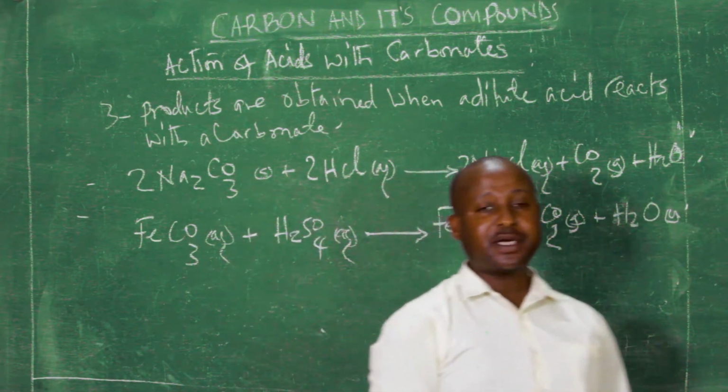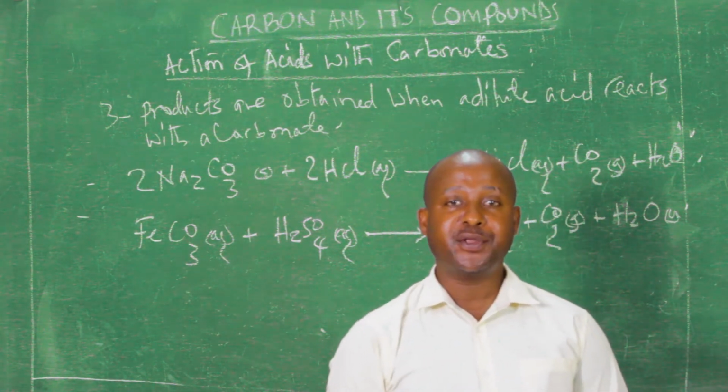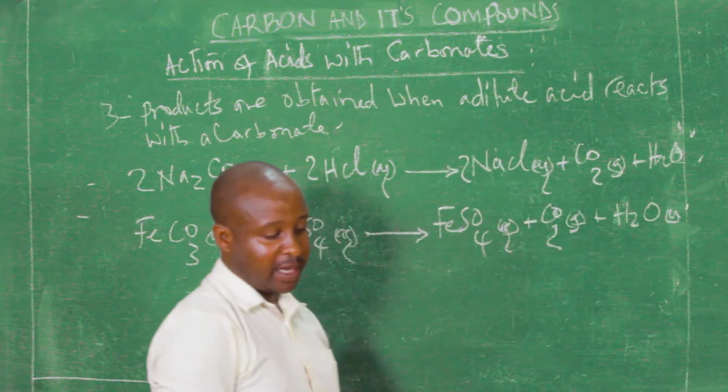How about when calcium carbonate reacts with dilute nitric acid? Let's have a look at this reaction.